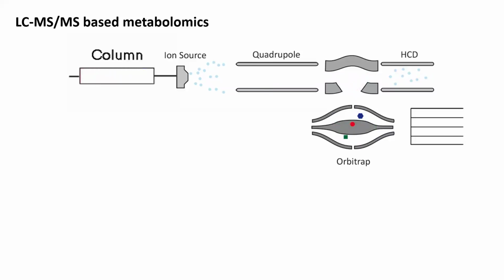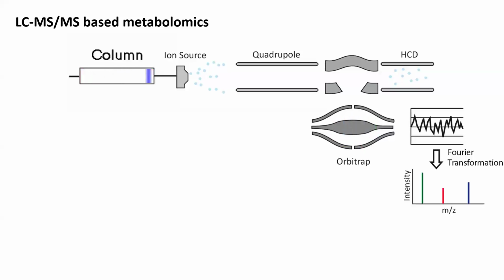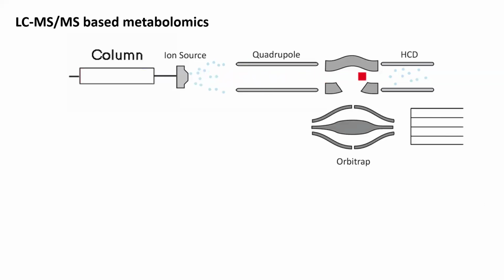The first step of every good analysis, and I hope you really take care of this step because it's very important, is the chromatography: choosing the best chromatographic way to separate molecules. For our MS detector, it's really hard to give us all the information from a really complex package of molecules. When molecules are separated, we use different ion sources.